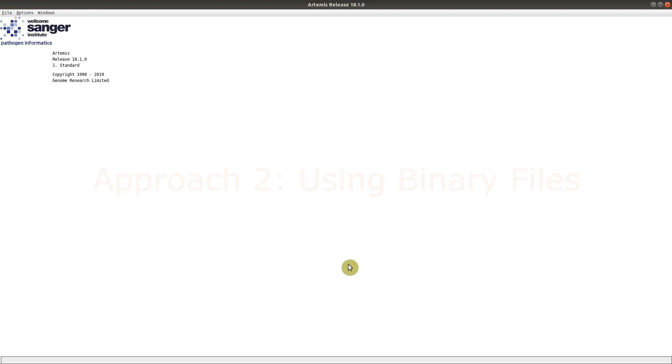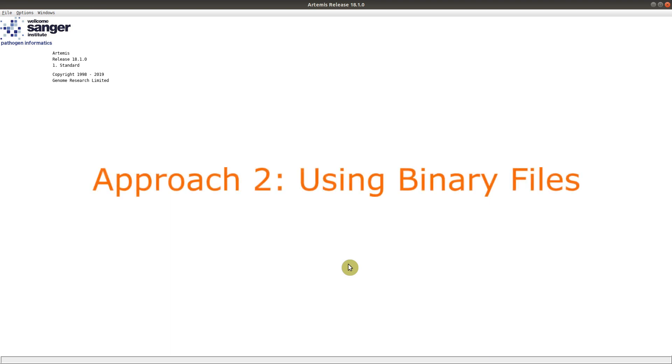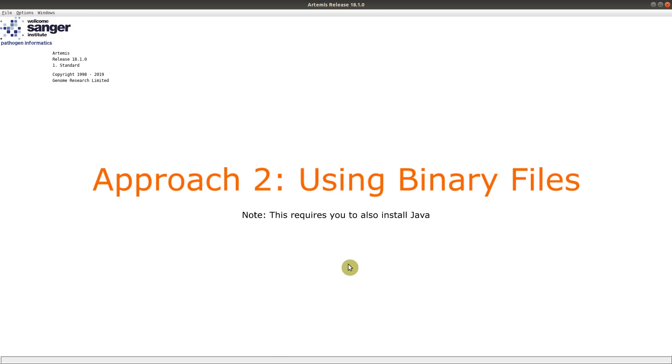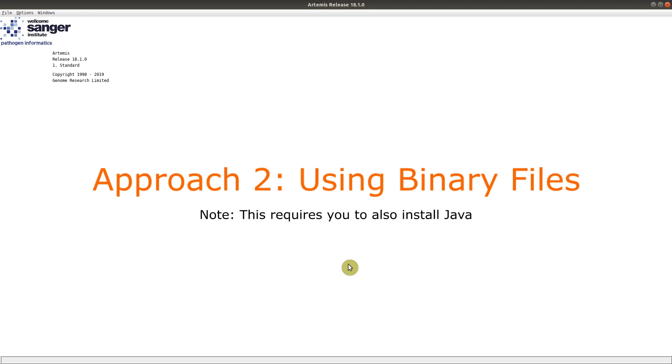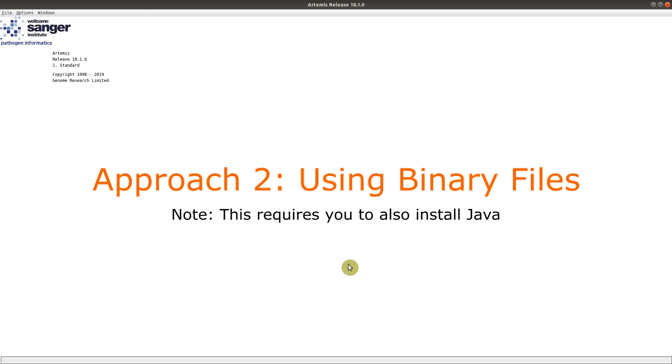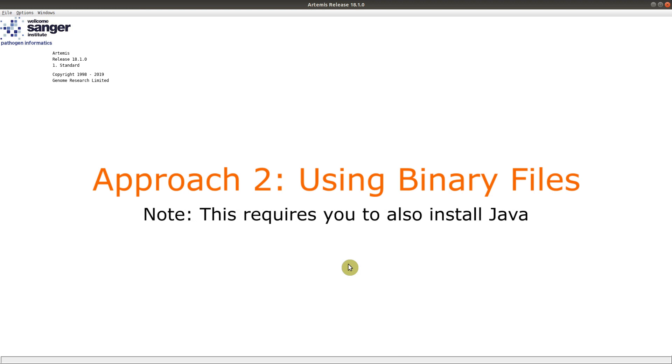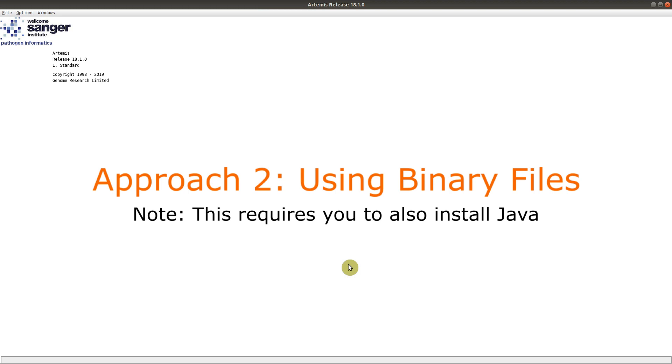The second approach is to install using the binary files. So with the binary files, you don't install per se, but you just download it and you run it. Please know that in order to run the binary files, you also need to make sure you have Java installed on your system as well.